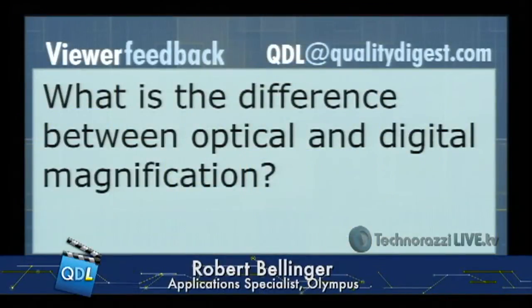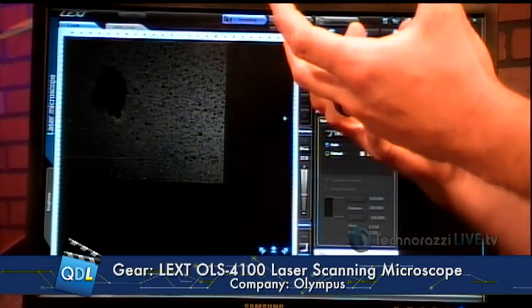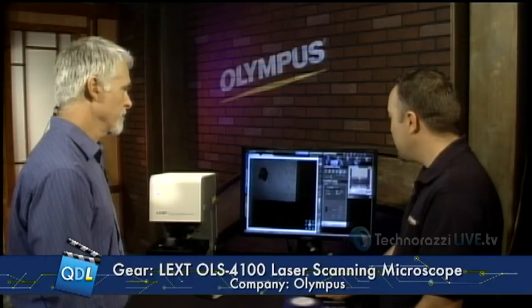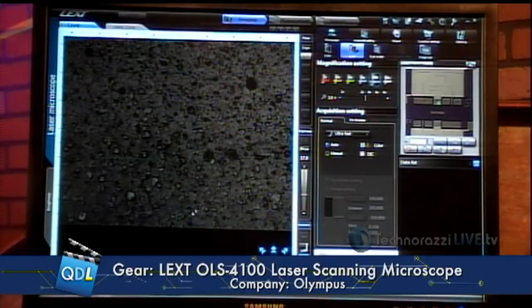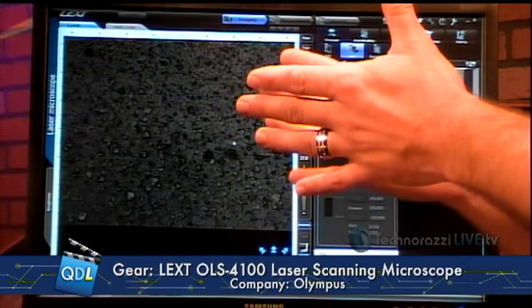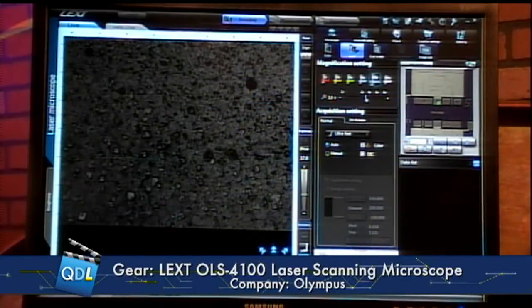We have a question: what is the difference between optical and digital magnification? Great question. This system is capable of having an optical image just like a normal microscope — it's limited to the objective. The objective magnifies the light to a certain value; right now we're magnified about a little over a thousand times. That's straight optical, just coming through the lens. Normal microscopes are limited by that. When we switch to the laser, it's actually scanning the image now. The laser can increase its magnification by reducing the scan area without any resolution loss. This is complete optical magnification — if I zoom in, higher and higher, the magnification goes — I'm over almost 3,500 times magnification here, with the same exact lens, just a smaller reduced scan area, same resolution capabilities, higher magnification. Similar to the way scanning electron microscopes get their magnification as well.